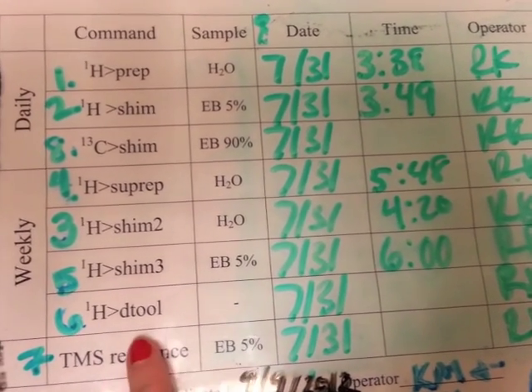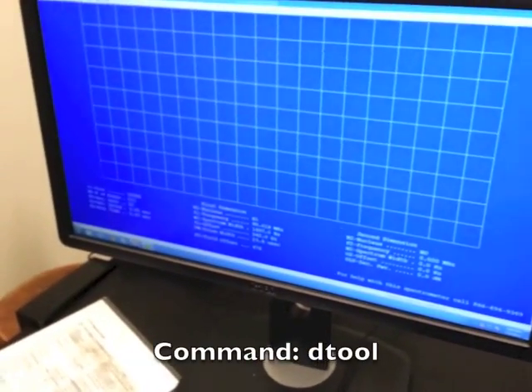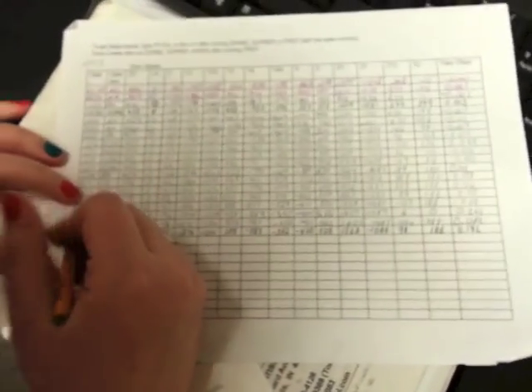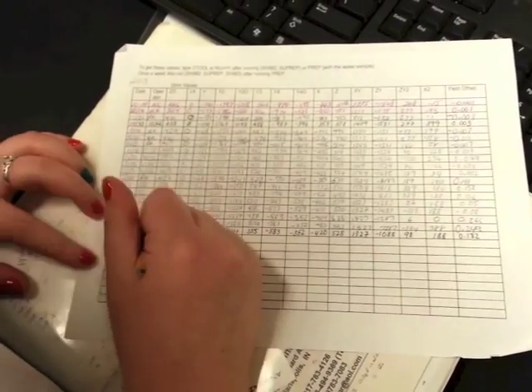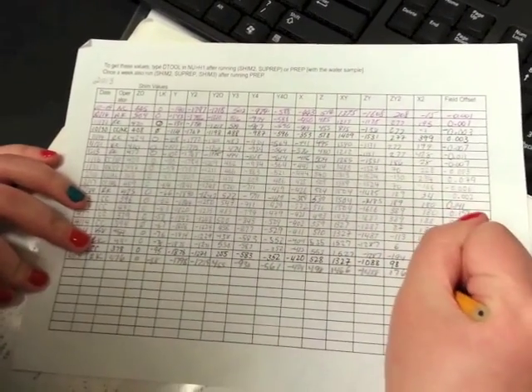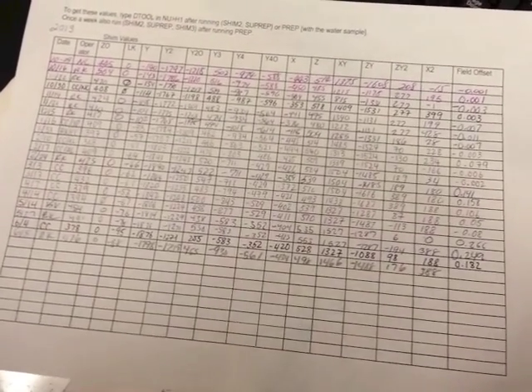Once SHIM3 is finished, the next step is DETOOL. This one doesn't have a sample next to it because we're not actually taking any scans. Come over to the computer, type in DETOOL and hit enter. All these numbers pop up, and there is a binder underneath the sign-in sheet. Take out your paper, write the date and your initials, and then all of the numbers go in order on the sheet. These numbers don't really mean anything to us, but if there's ever a problem with the machine, they may ask you to read out the last four of a certain column for the people who can fix the machine.